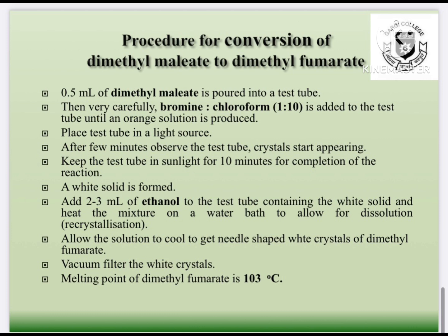After few minutes crystals start appearing. The test tube was further kept for 10 minutes in the sunlight. A white solid is formed. To the white solid, 2-3 ml of ethanol is added for recrystallization and white crystals form.